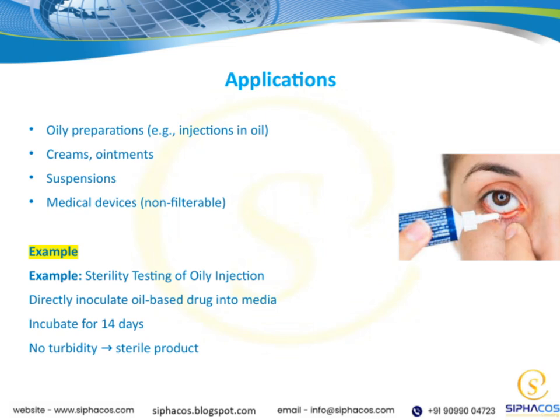Suspensions are also included. They are liquid preparations with solid particles dispersed throughout, and maintaining sterility here is crucial to prevent contamination. Lastly, we have medical devices that are non-filterable, meaning they can't be sterilized through filtration, so alternative testing methods are necessary. To give you an example, consider the sterility testing of an oily injection.